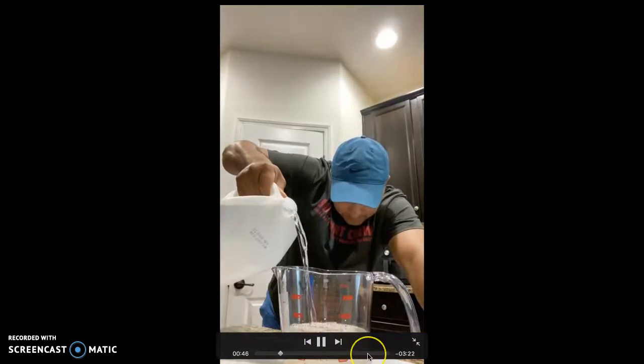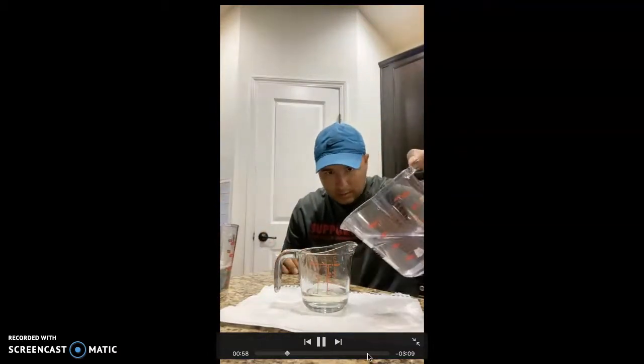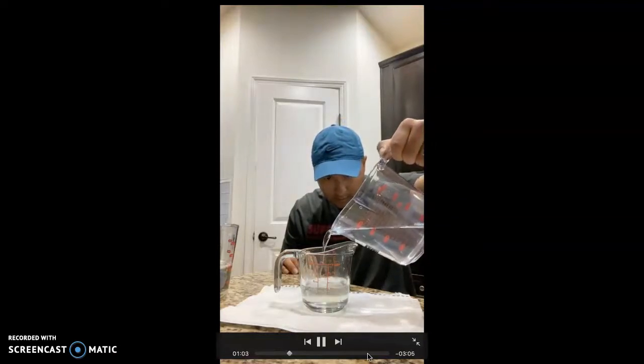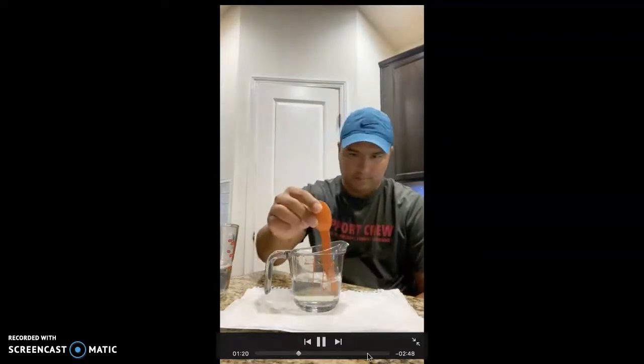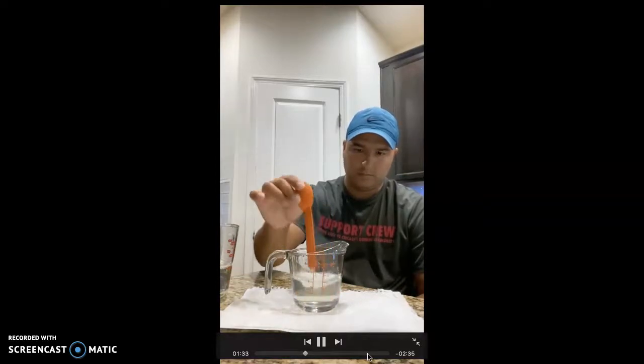Basically, what happened here is when we mix the two solutions, two reactions start to happen. In one solution, we have the iodine and the vitamin C, which had reacted already into iodide and hydrogen ions. And on the other solution, we have a mix of hydrogen peroxide, the water, and the starch. Once the two solutions are mixed, the hydrogen peroxide oxidizes the iodide, the I minus, into iodine, and at the same time, the vitamin C reduces the iodine into I minus. So for a while, the two reactions happen at the same time, and the solution remains clear.